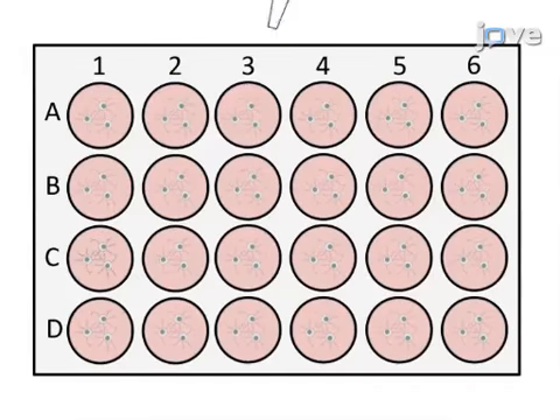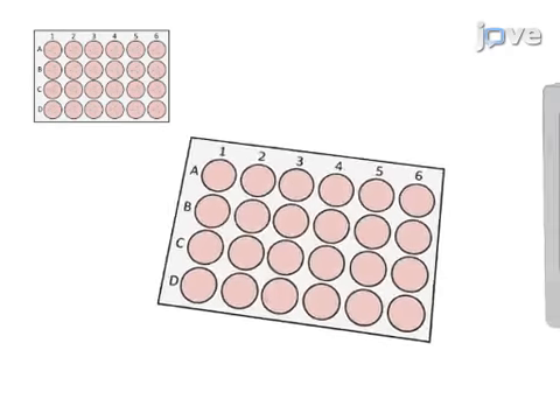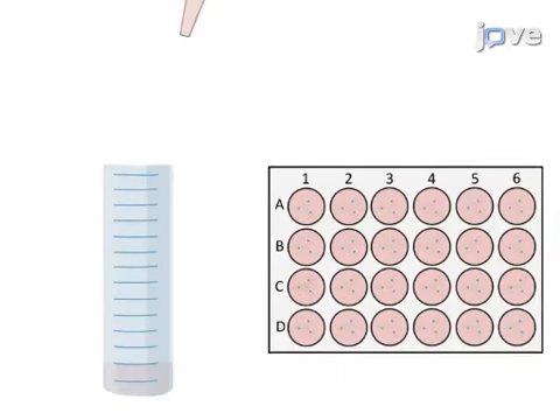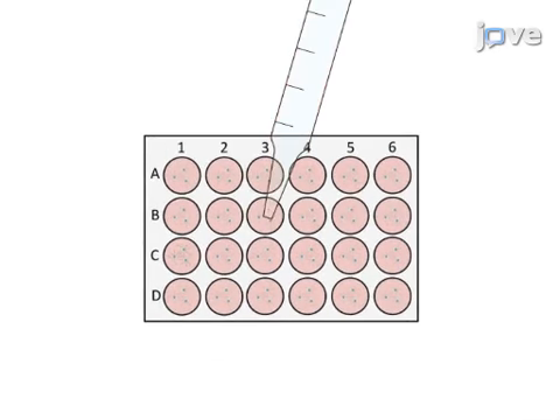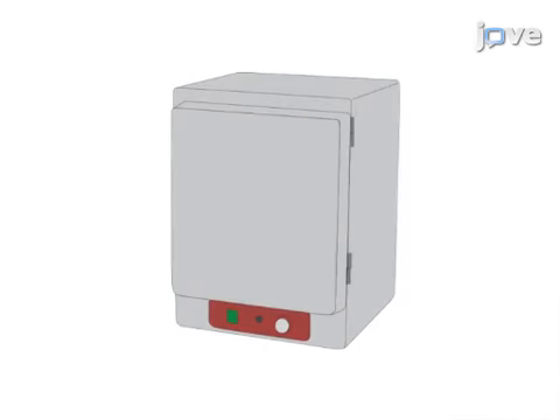Next, half of the MEM medium from the CGC cultures is removed and retained in the incubator, and the CGC cultures are then replaced with an equal volume of LLME-containing MEM medium and placed in the incubator at 37 degrees Celsius with 6% carbon dioxide for one hour.